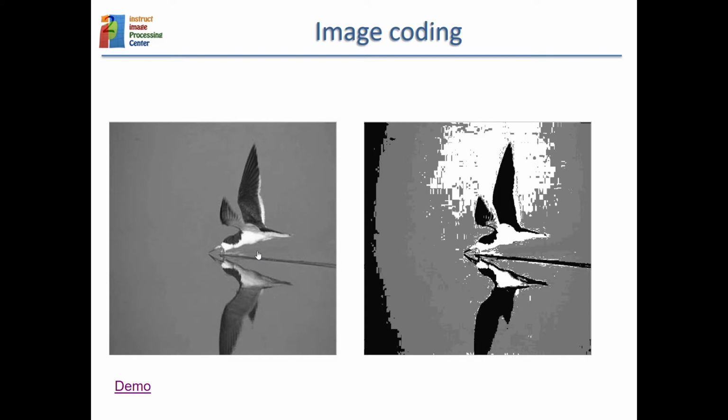So it is not directly the number of frames that you have added. If every frame goes from 0 to 15, and you are adding 10 frames, then your maximum sum goes from 0 to 150. And to store that number, you need 8 bits.